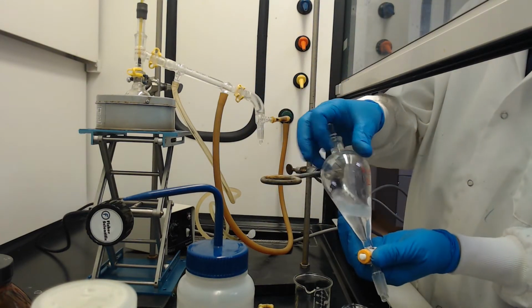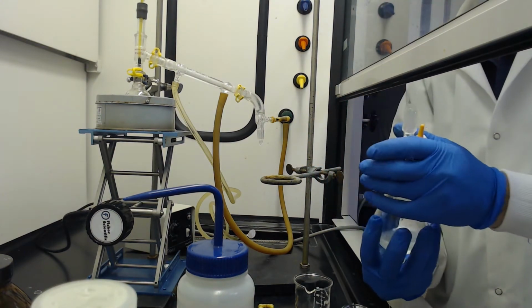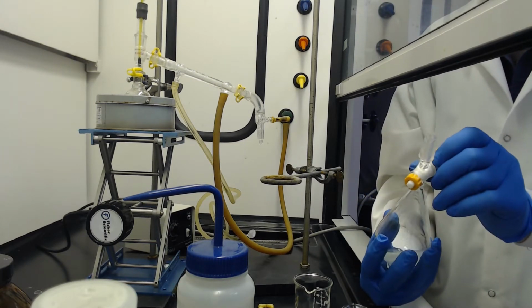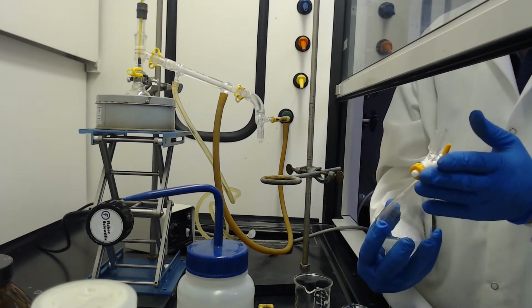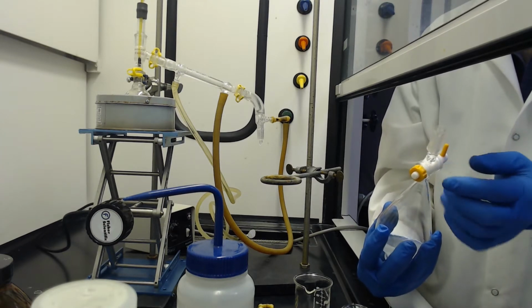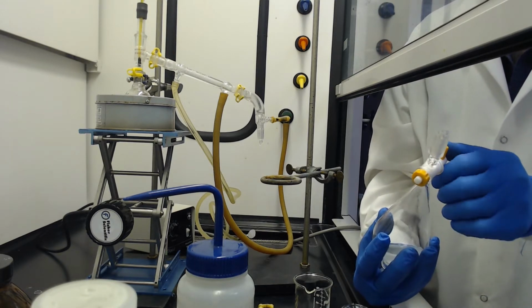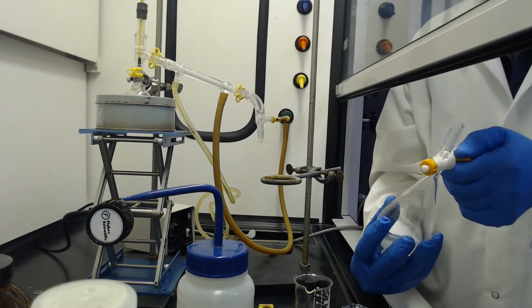And I like to keep my hand on this, flip it over, and immediately vent. And make sure, especially when we're setting up this apparatus, that this stopcock is secured. Another thing to remember, I don't know if we've mentioned it in this lab series, is that when you're done and you clean the stopcock off, these Teflon stopcocks can warp. So you want to loosen them up and store them. They can be kind of assembled, but make sure that they're loosened up, not tightened in there, because over time they will warp and then they'll start leaking, and they're actually kind of expensive.